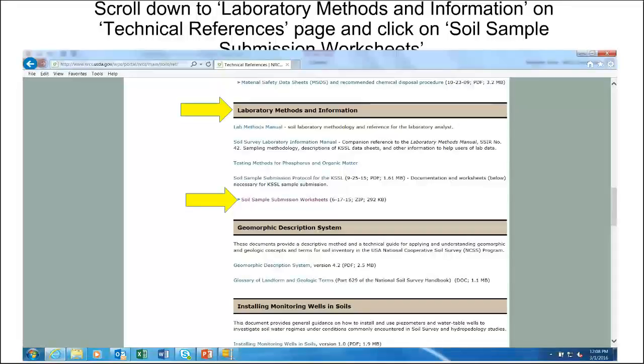Now the water correction on the less than 20 is to figure out what the weight of dry soil is. You factor down the less than 20 weight by the amount of water so that you wind up on a dry soil weight. Right. So it doesn't need to be sealed any different than we normally do, which is 4 or 5 staples across the top with a double fold. And if you do actually sieve it, it's probably going to lose the free water by the time you go through that sieving process anyway. Right. So it's going to be similar to the decanted soil.